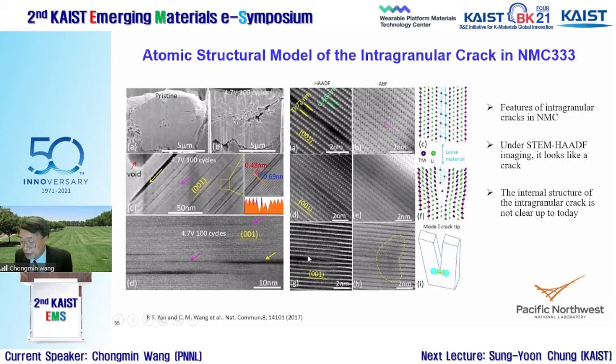And our recent study actually shows this is not really cracking. There are some materials within this one. If it's really cracking, it's two materials separating in some way because they fracture. That's kind of with certain resolutions.